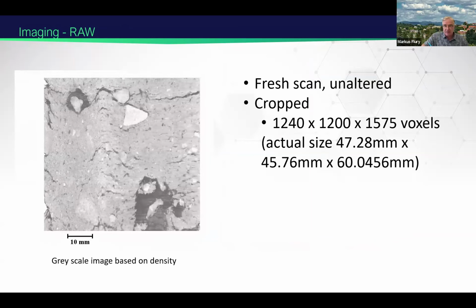May I ask a question, Billy? Yes, sir. Okay. When you say connected, non-connected pores, does that mean that the connection is dependent on the resolution? Let me go back here real quick.